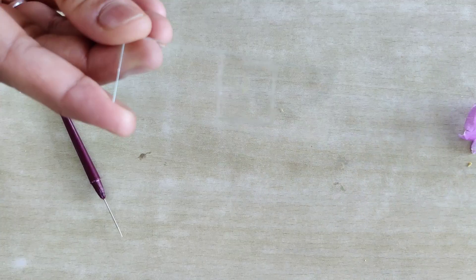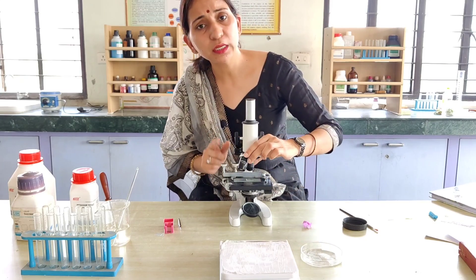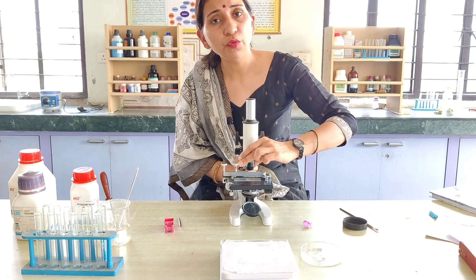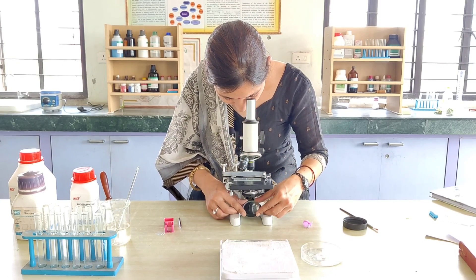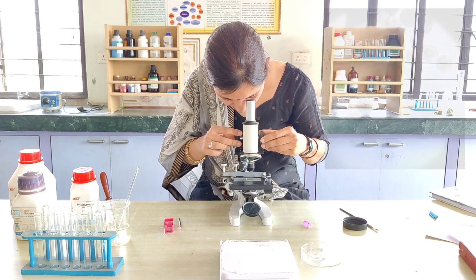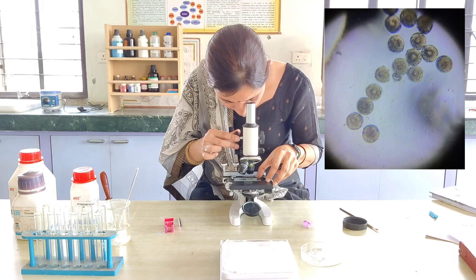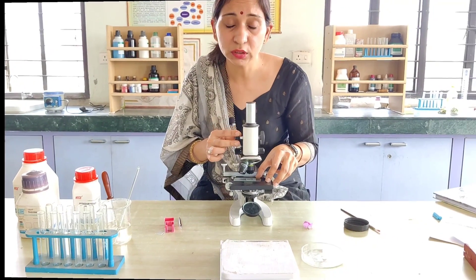Now we will see it under the microscope. We will search for the pollen grains and then observe after 45 minutes at 10x magnification. Let's adjust the slide properly — here you can see that we are able to see the pollen grains.